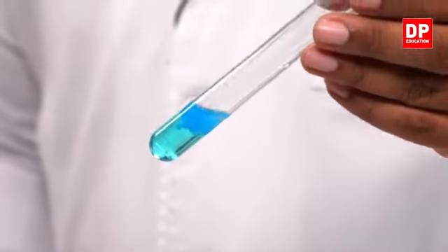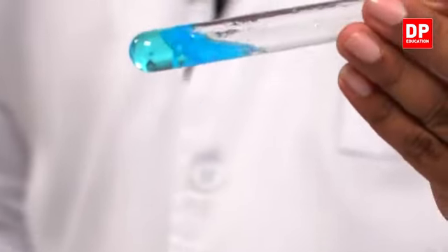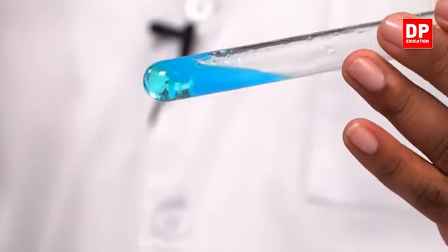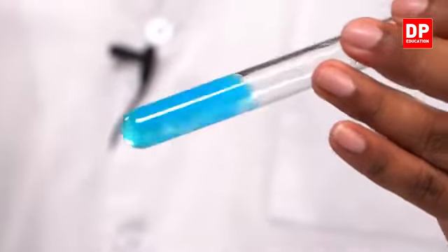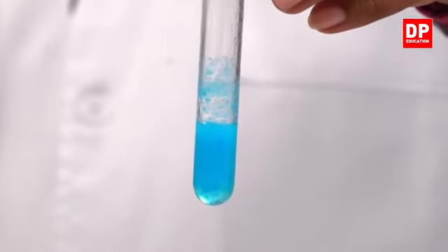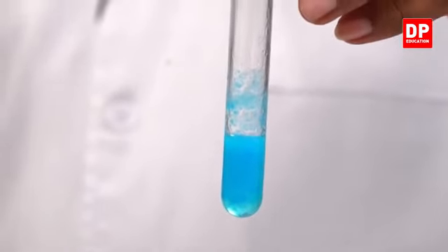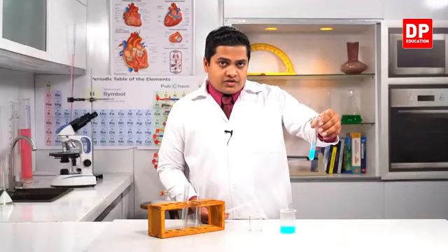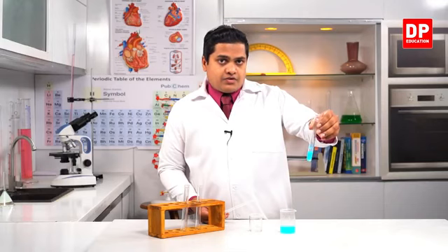So precipitation means, here you can observe, see, this is a type of a solid. It's not getting mixed. See, a type of a solid. You can see it on the wall also. A type of a solid that is not getting mixed or not getting dissolved within the solution, because it is a precipitation.